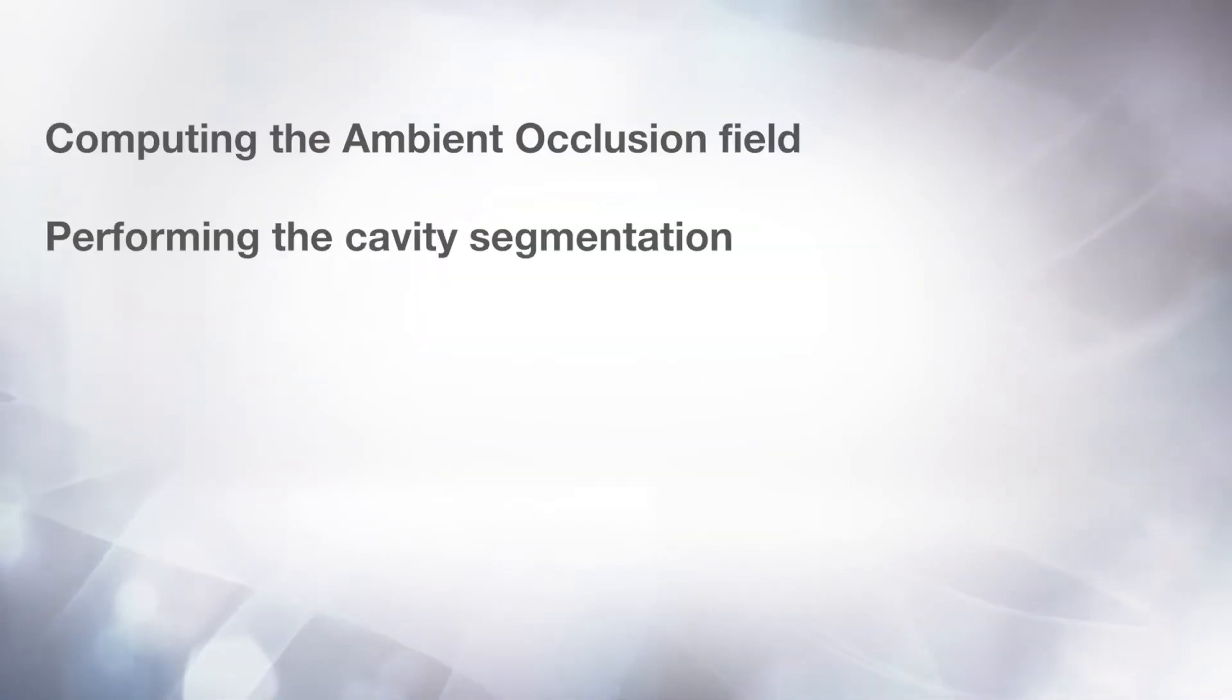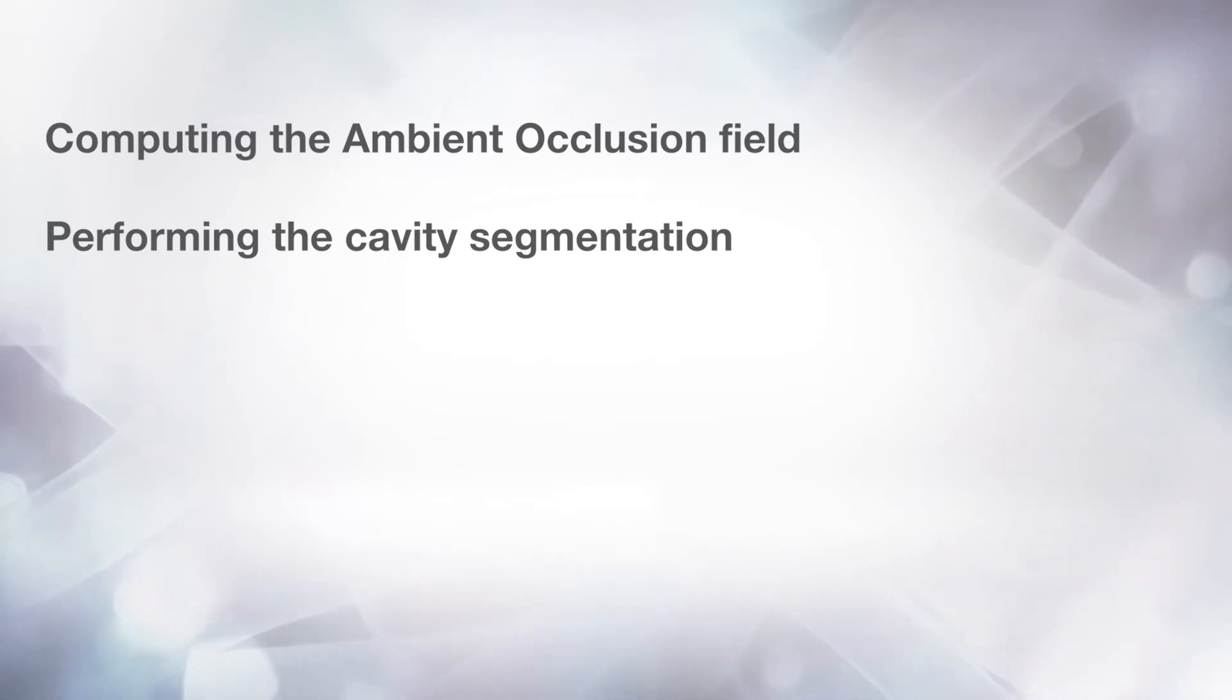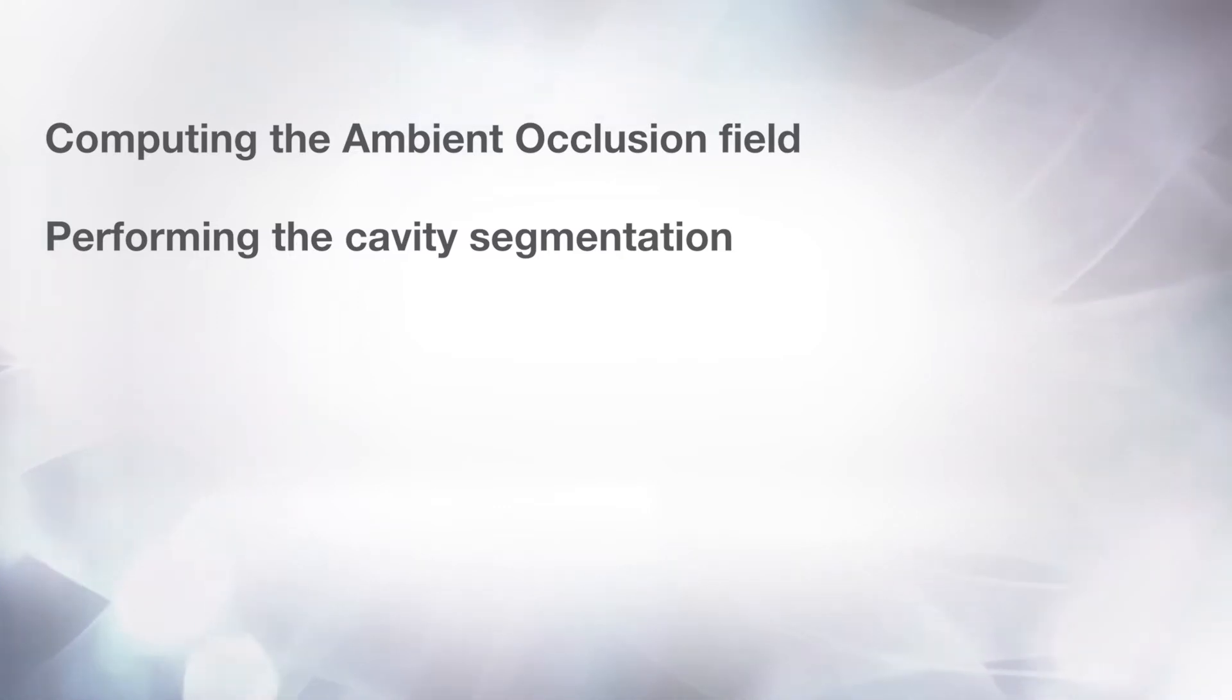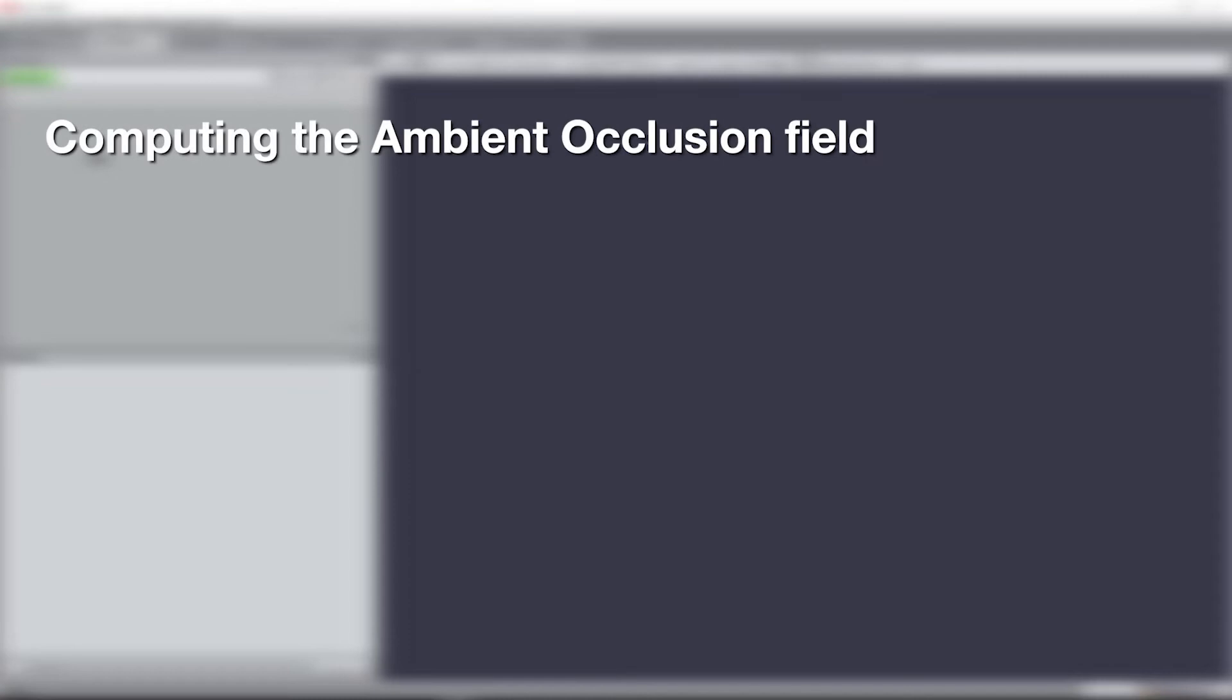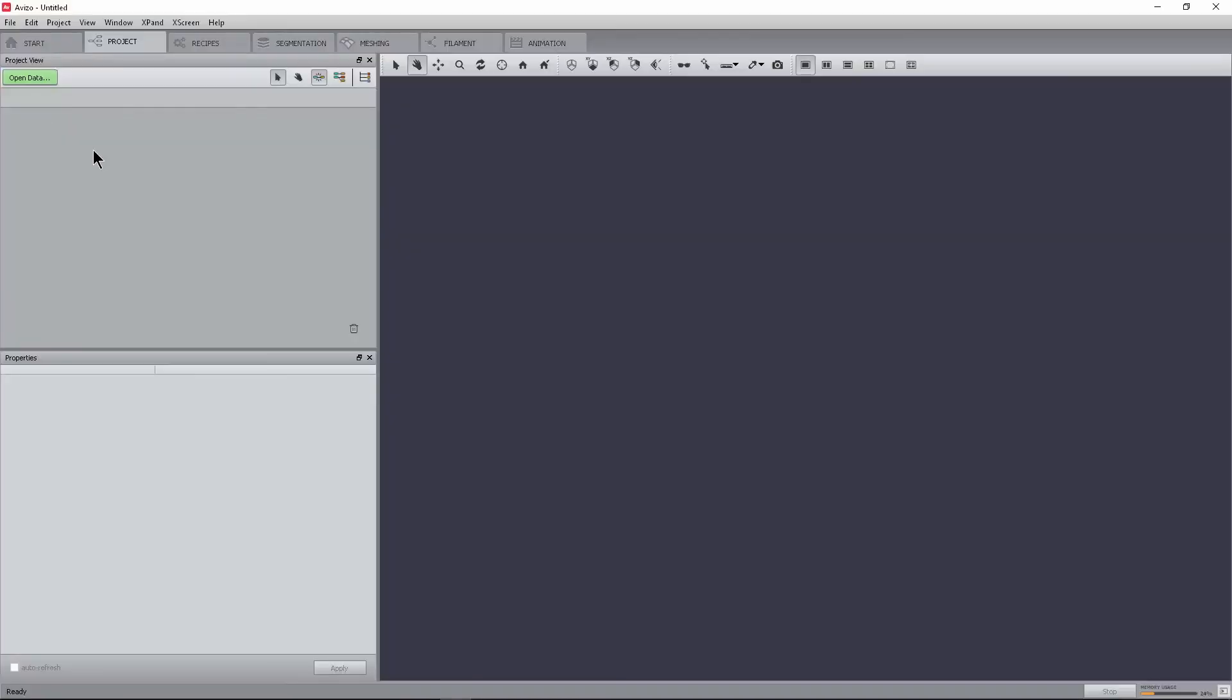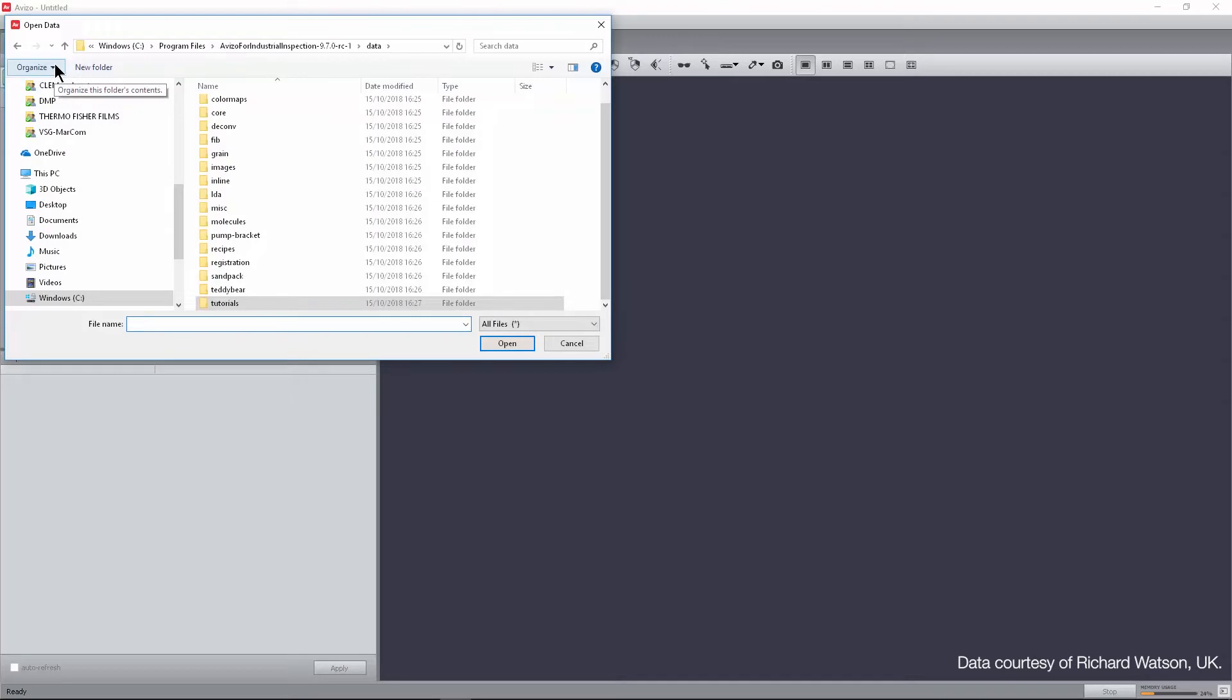In this tutorial, you will learn how to compute the ambient occlusion field and then how to use it to perform the cavity segmentation. In this example, we will compute the cavities for a stone dataset with bioerosion traces that are to be segmented. The data is courtesy of Richard Watson UK. First, load the dataset StoneBinarySegmentation.am from the folder DataTutorialsCavityAnalysis.